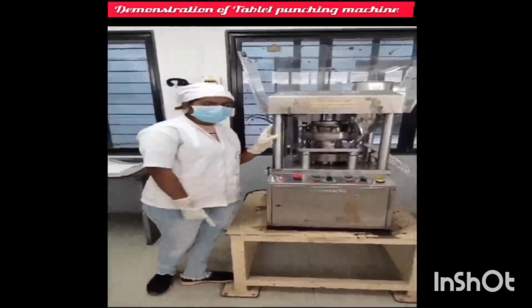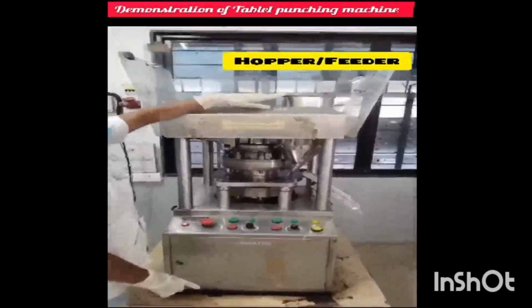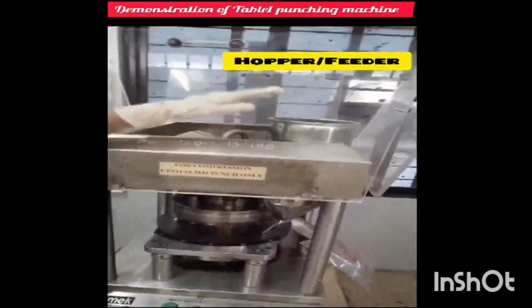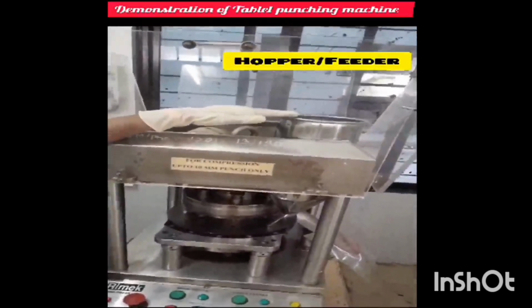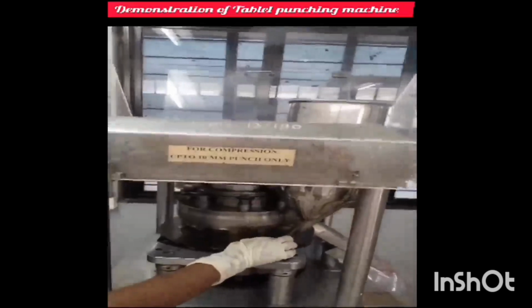So the first and basic part is the hopper. Now this hopper is used to feed the feeder. The feeder here is our granules and powder. The granules and powders are fed from this hopper. By this it comes down and from here it gets into the dies.